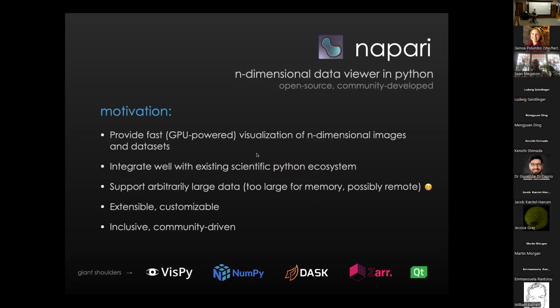The real motivation for Napari was to provide fast GPU-based visualization for multidimensional datasets in Python. Pretty much everything I say here has Python underlined. Python, of course, is a rapidly growing language — it's becoming the lingua franca of science. We have tools like Matplotlib that are incredible for visualizing data, but if you've worked with multidimensional data, you quickly hit a frustrating point. Matplotlib does have 3D viewing, but it can be a little slow, and navigating multiple dimensions can get clunky. One goal was to simply view multidimensional data with no hard restrictions on maximum dimensions — in theory, we should be able to expand to 20 dimensions, giving you a slider for every unused dimension.